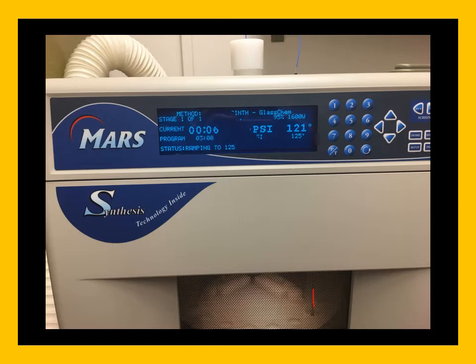Recall that water boils at 100 degrees centigrade, and we're going to go up to 125 degrees centigrade. The only way that we can get up to these temperatures is to have extremely high pressure. This is similar to the process in pressure canning, in which a high pressure allows you to increase the temperature over the boiling point of water at 1 atmosphere. So in order to get water to be boiling at 121 to 125 degrees, we have extremely high pressure within this vessel.